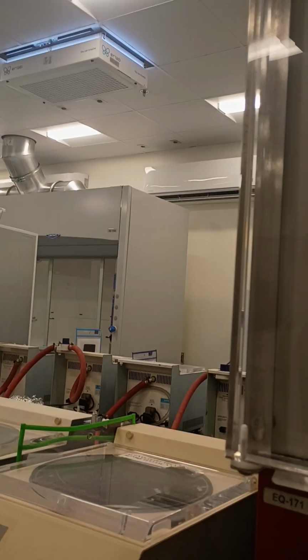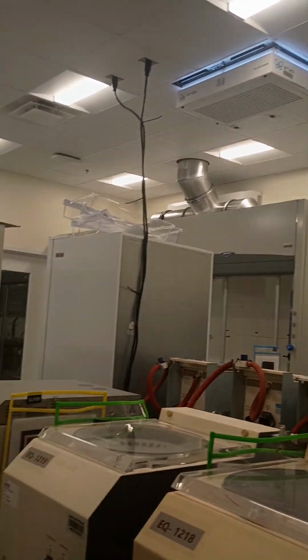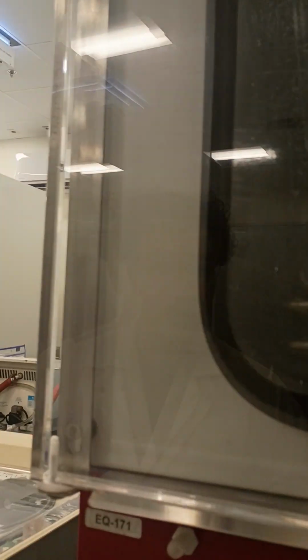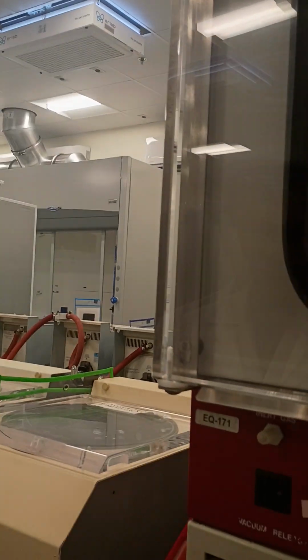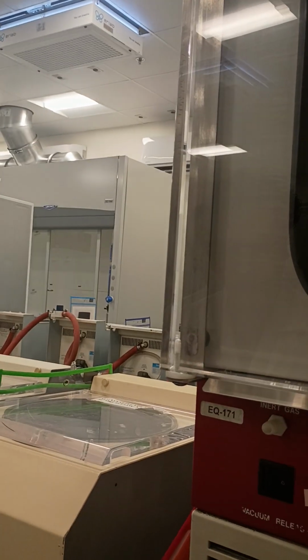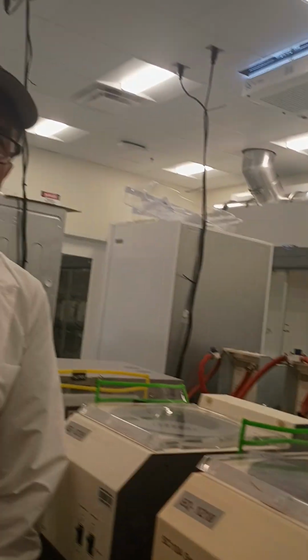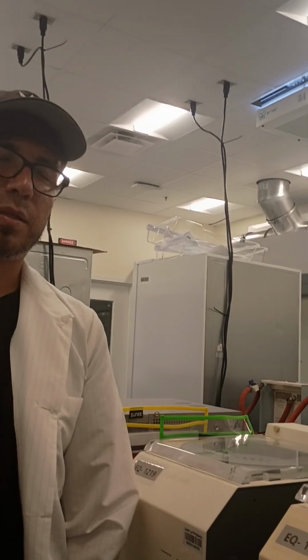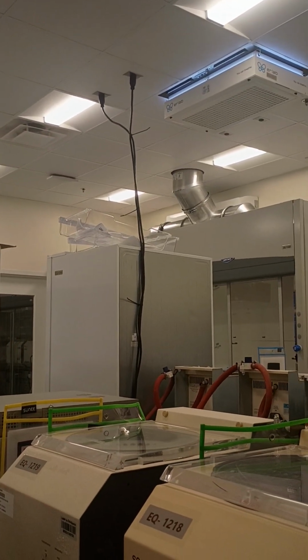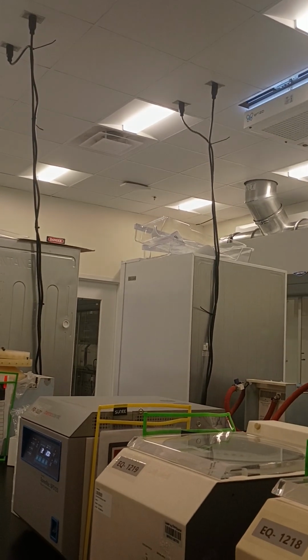For now I'm running it, but since it's the weekend and nobody's going to be there, I'm not going to turn on the heat. I'm just going to have it act like the tree one, using only the vacuum. It's slower, because the heat accelerates the process a little bit. But right now it's just using the vacuum.